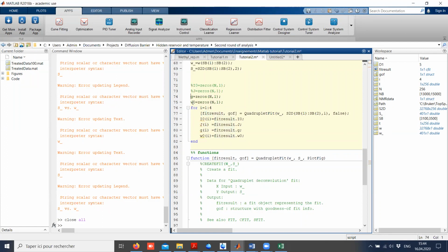That I understand, but I was just writing in the chat, but I'll say it here. Let me give you another example. Say you have a spectrum which takes greater than n iterations to fit. Will the fact that you've allocated n space mean that the fit will stop before it converges? Oh, no, this n, or what I'm defining here, is I'm making a new fit all the time.